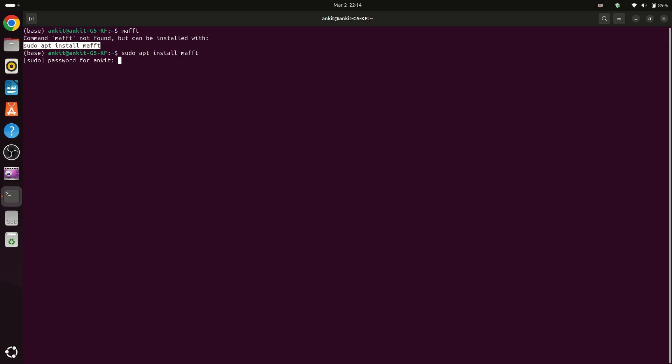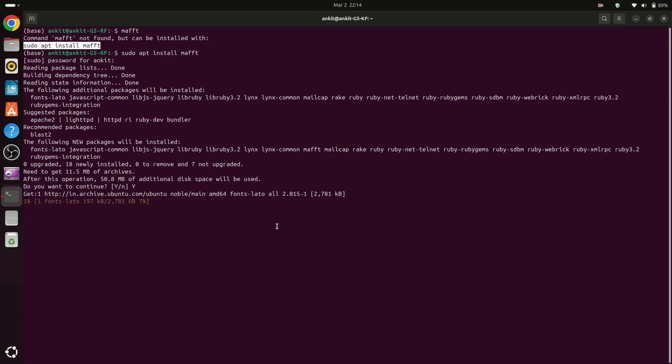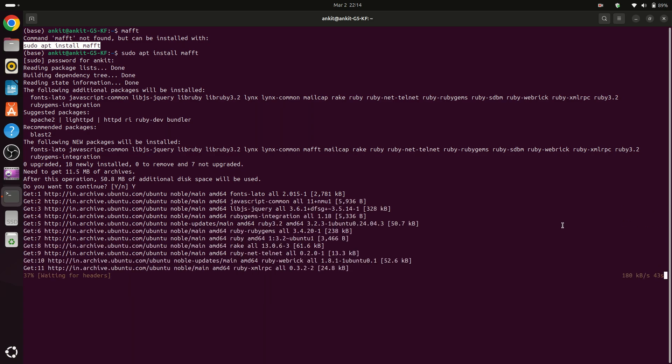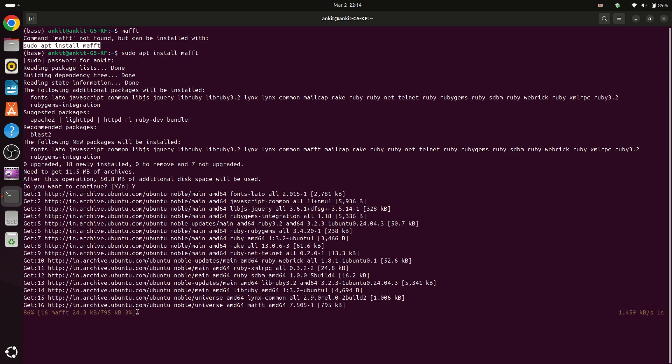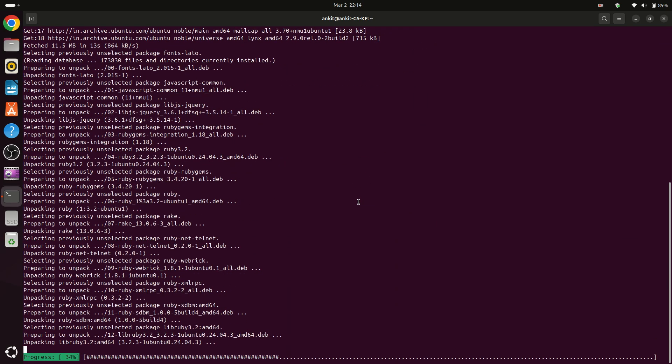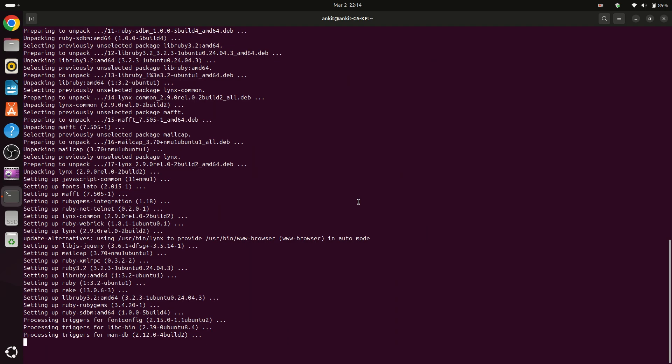Now you have to type your password and press enter. After that you have to write yes. Now you have to wait for a while and MAFFT is getting installed.